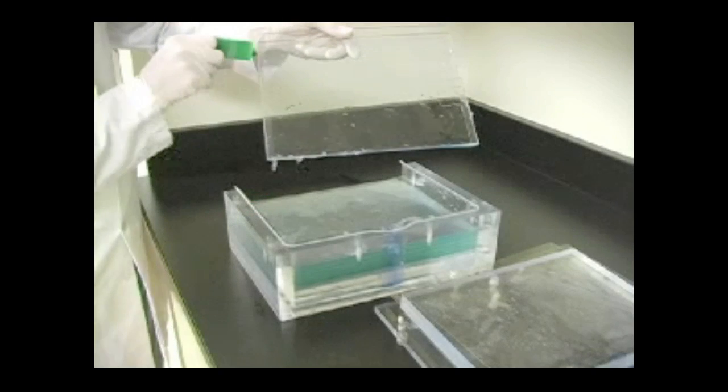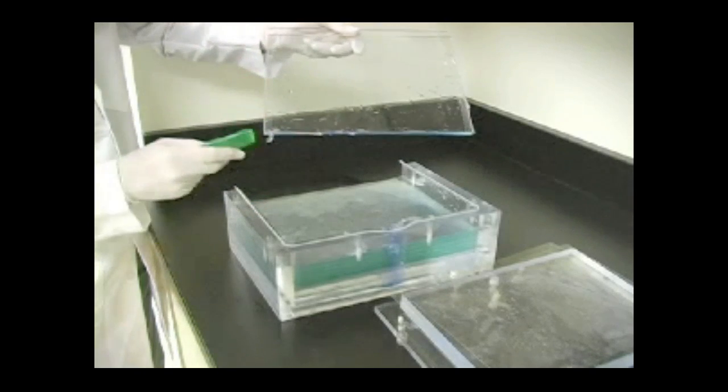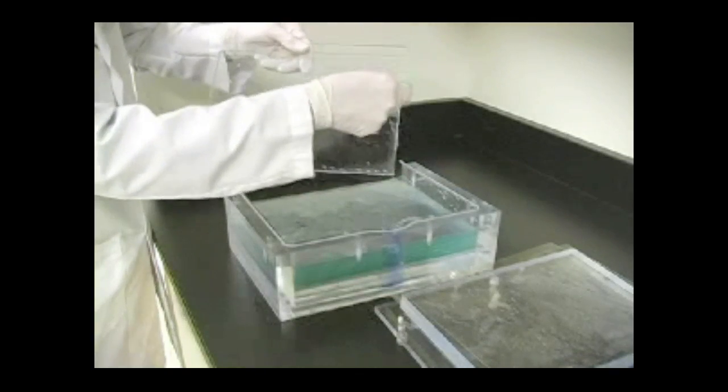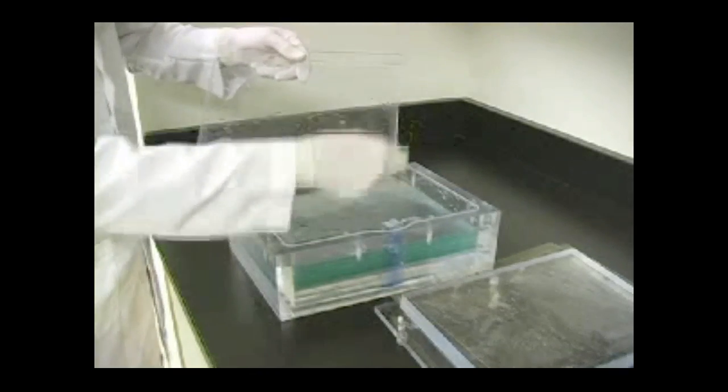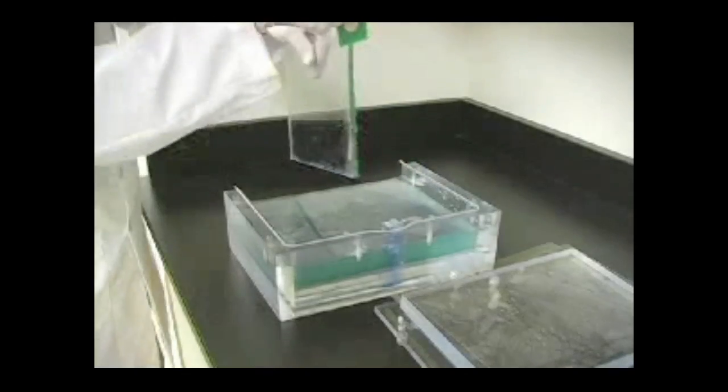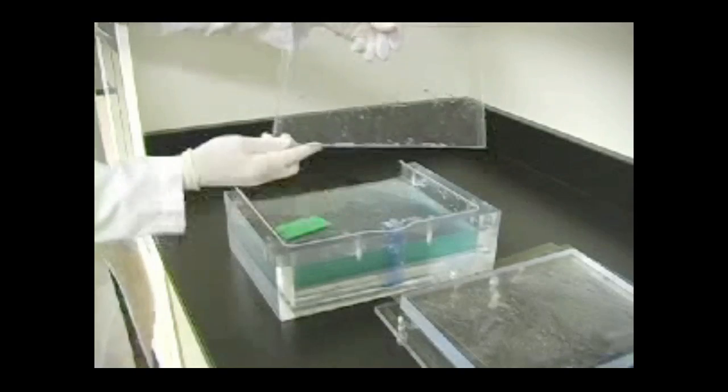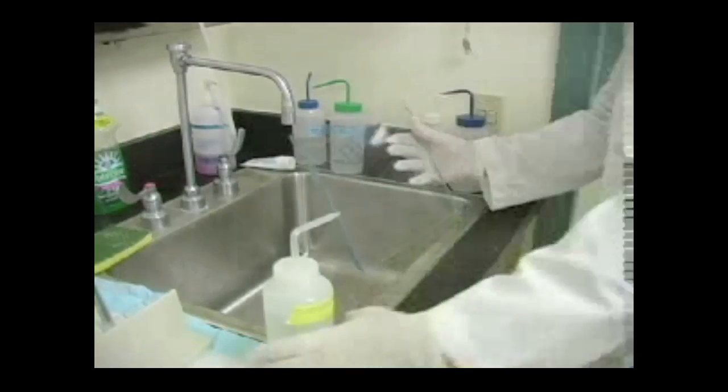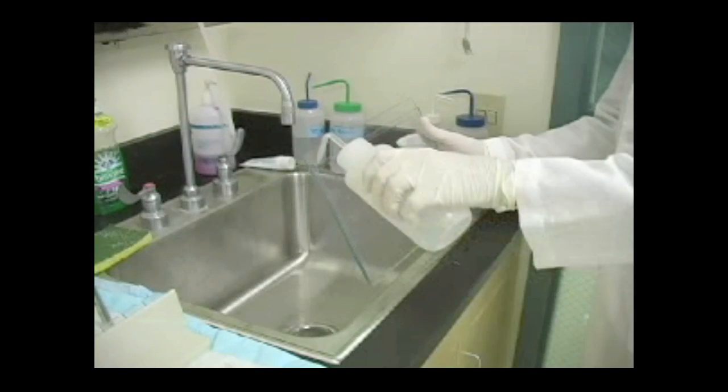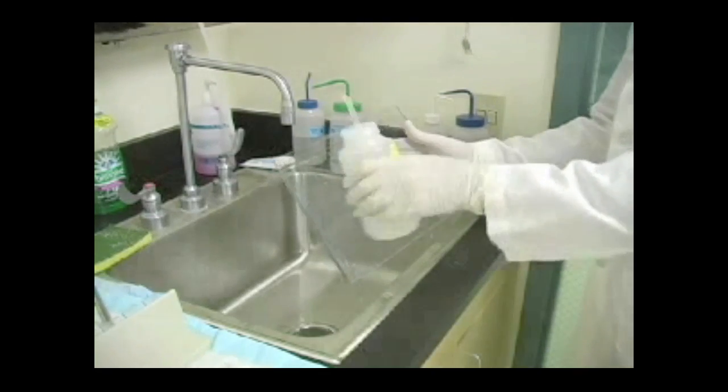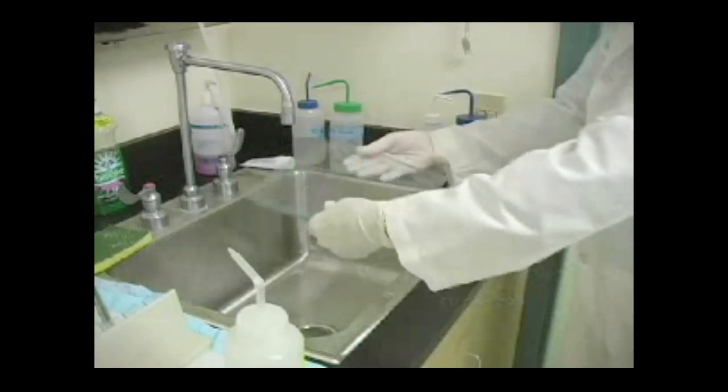Trim off excess acrylamide around the glass edges with the gel releaser. Rinse off the tops of all the gels thoroughly with distilled water. Wash off any pieces of excess acrylamide with distilled water.